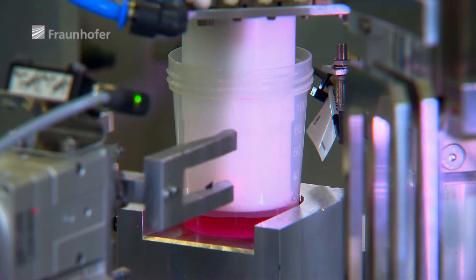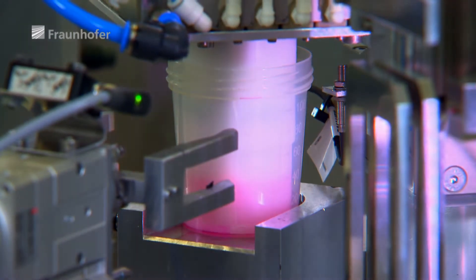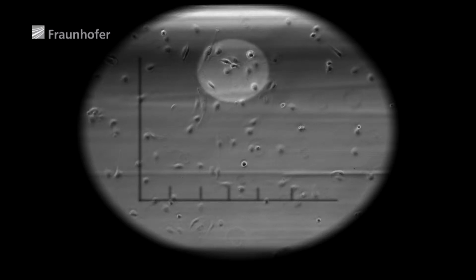At the beginning of Module 2, the isolated skin cells are filtered out so that they can proliferate. This process of cell division can be easily detected under the microscope. The cells are dividing here at the top, in the highlighted region.